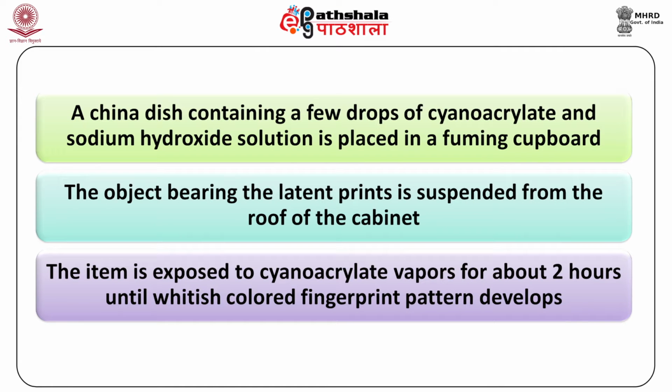You see, a china dish containing a few drops of cyanoacrylate and sodium hydroxide solution is placed in a fuming cupboard. The object bearing the latent prints is suspended from the roof of the cabinet. The item is exposed to cyanoacrylate vapors for about 2 hours until a whitish colored fingerprint pattern develops.